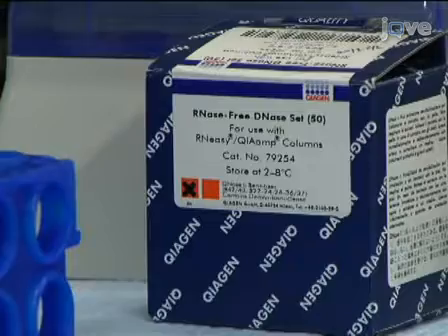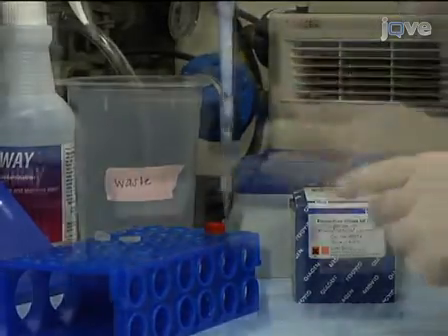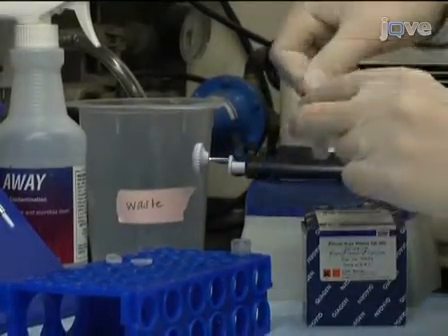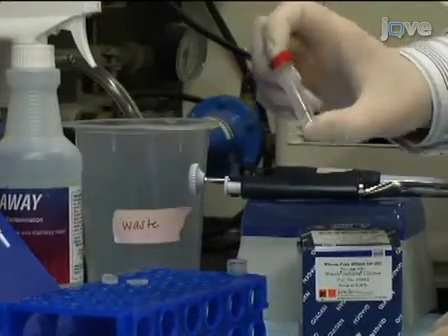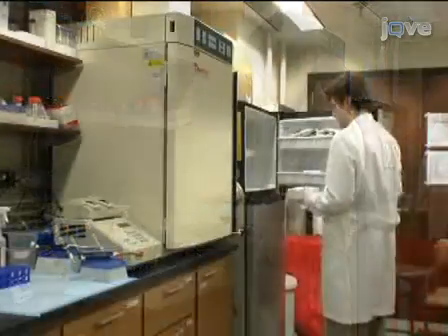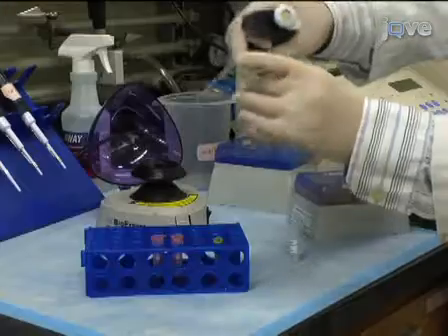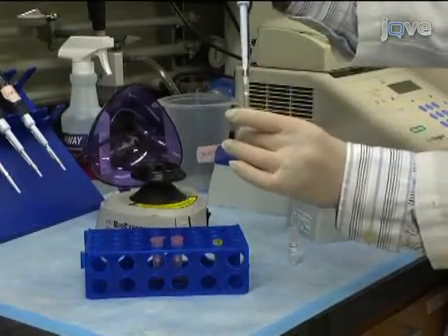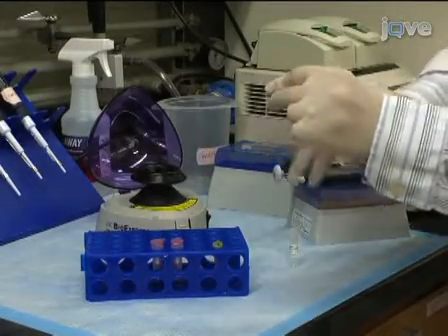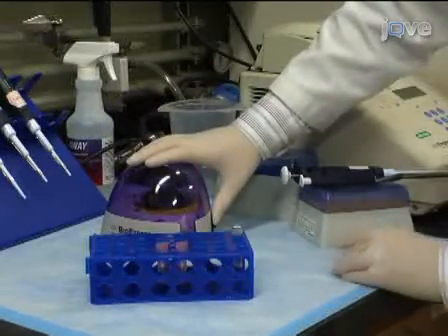To remove DNA from the sample, follow with the DNase treatment using the RNase-free DNase kit. Upon receiving the kit, add 550 microliters of nuclease-free water to the DNase and mix gently by inverting. To store the stock solution, divide it into 10 microliter aliquots and freeze at minus 20 degrees Celsius. Add 70 microliters of buffer RDD to 10 microliters of DNase I stock solution, mix by gentle inversion, centrifuge briefly, and add directly to the RNeasy spin column.